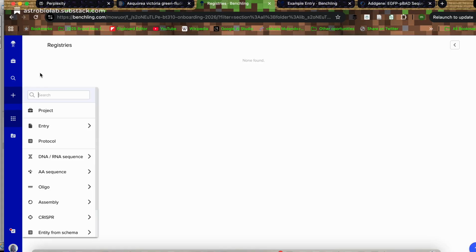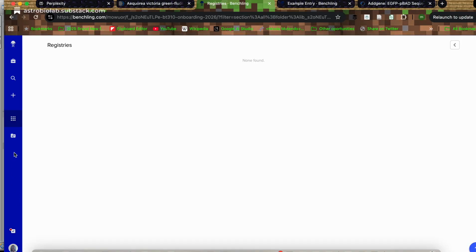So what we'll be doing for your homework, which was basically asking you to create a new sequence of GFP and also to prepare a primer. So how do you use this thing? You have to remember that there's two sections as well. There's the molecular biology section and the notebook section. The molecular biology section is the section you go to when you're trying to do your cloning, make your constructs and all that. Your notebook is the section you go to when you are making your actual journal. So instead of having a physical lab journal, you'll be using this as your journal.